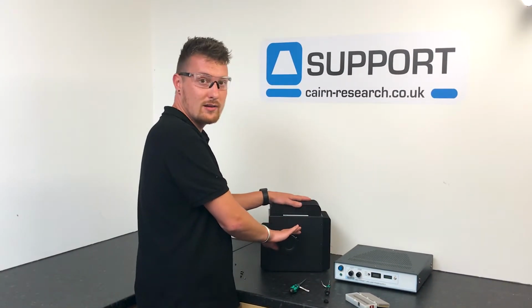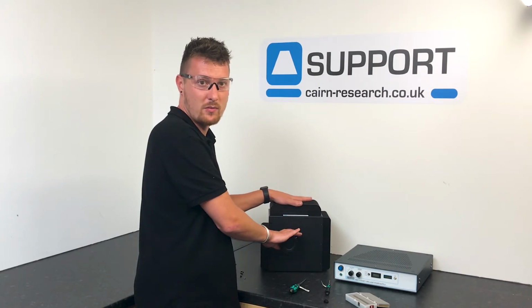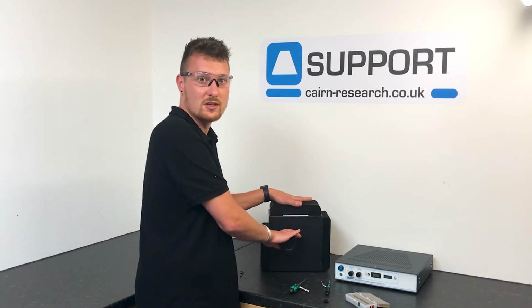If you have a new lamp house and new lamp bought from us, this will all be done for you, so you can skip this step.